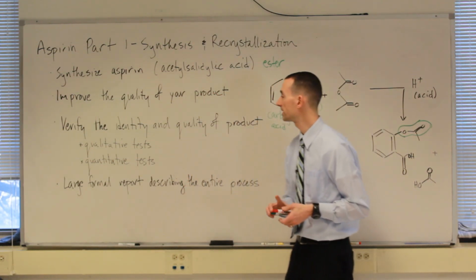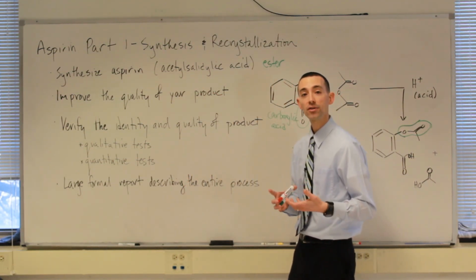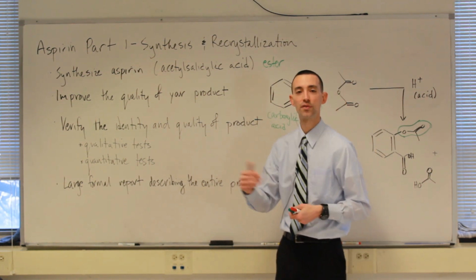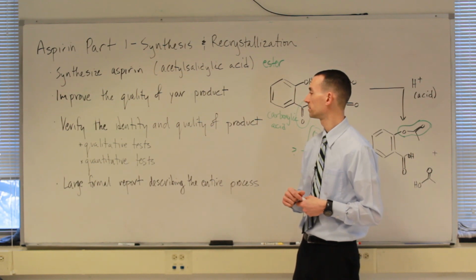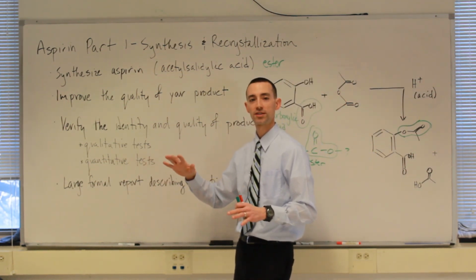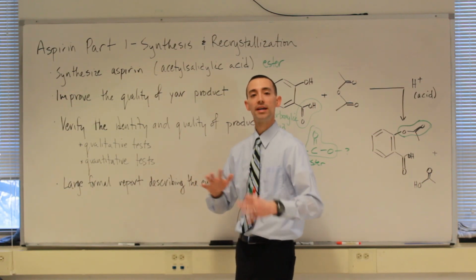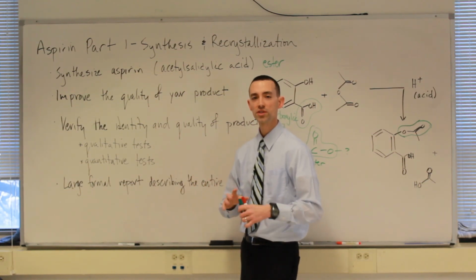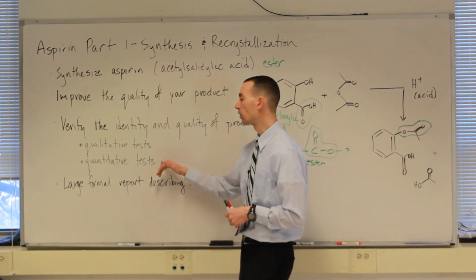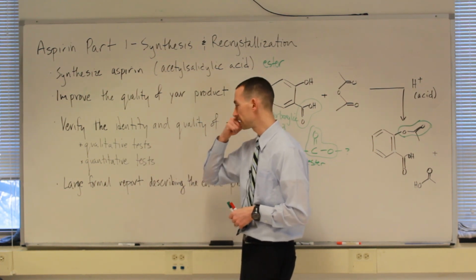Then that's where we'll end today's work, but to set the stage for what you'll do the next couple of weeks then, you'll set out to prove that that recrystallization improved the quality of your aspirin. Okay? We'll do some qualitative tests that simply show us sort of a yes or no, is our material better or worse, okay? Pre and post recrystallization. And then in the third week, we'll do some quantitative tests.